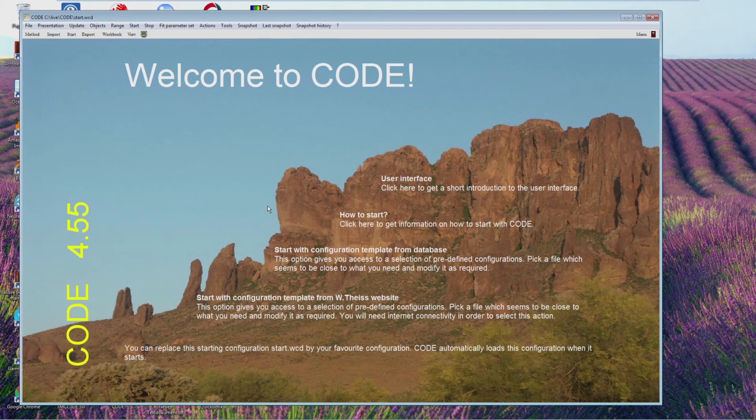They deposited several samples with evaporation times of 1 second, 2 seconds, 3 seconds, and so on, up to 22 seconds. And the purpose of the fit is to find out the layer thickness, the silver layer thickness for each sample, and then get in the end the deposition rate of this process.